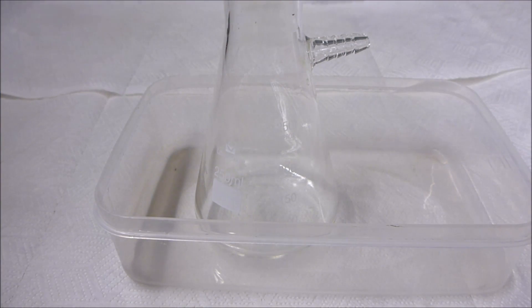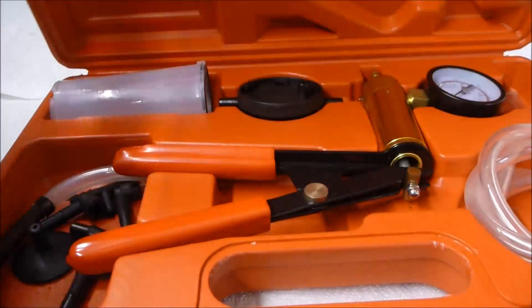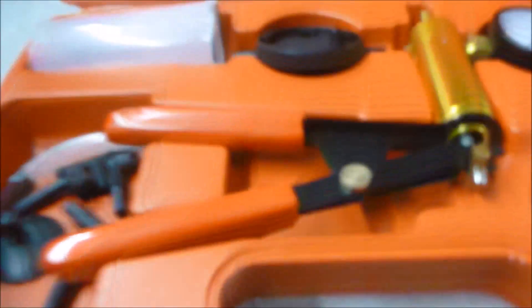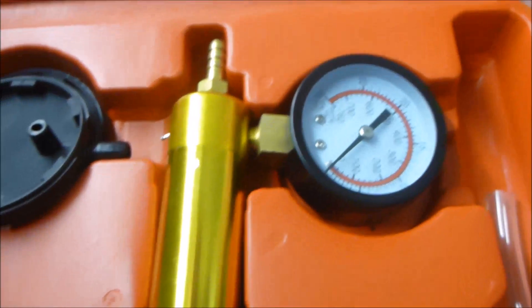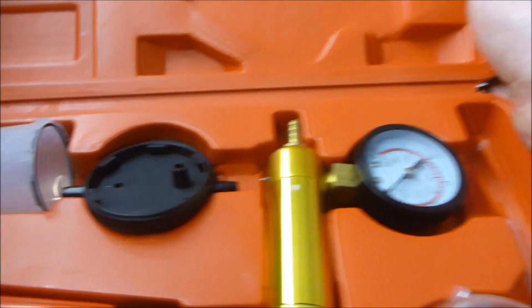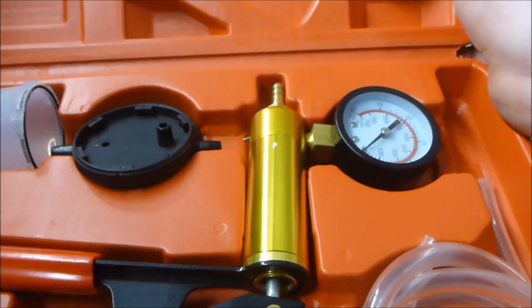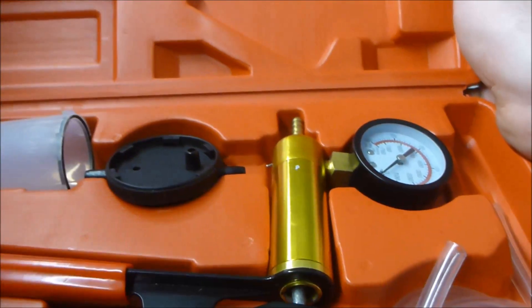The nice thing with the vacuum flask is it's got a little bit of nip for the source of our vacuum, which is going to be an automotive brake bleeding kit. These automotive kits have a manual vacuum pump, and the only bit we're really going to use is the vacuum pump and one of the bits of hose.